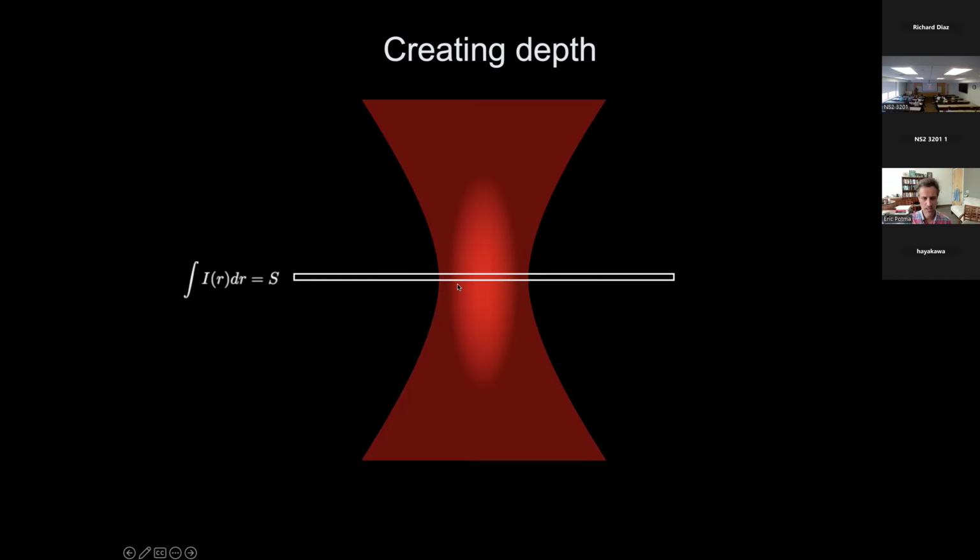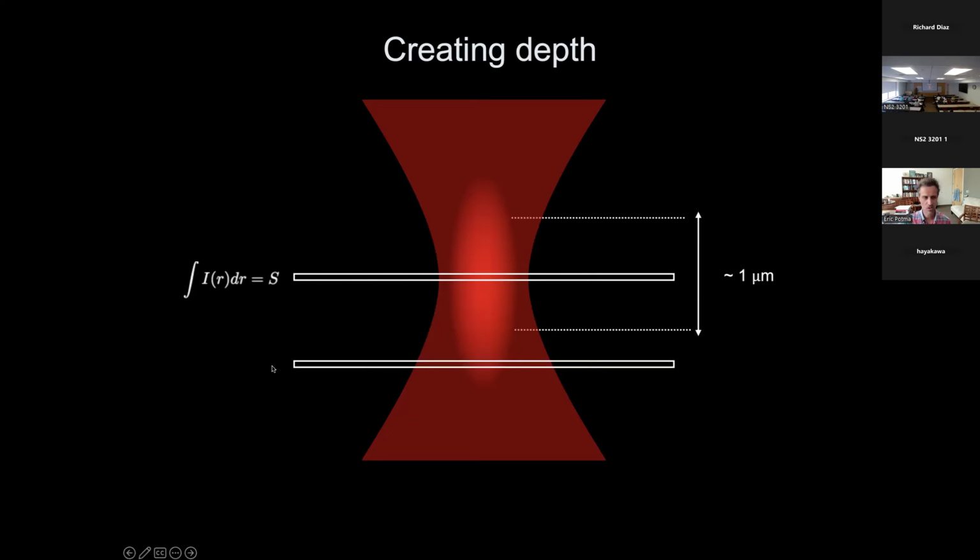But the question that I'm asking myself, what happens if I lower this detection plane? So what if I now move it beyond the length of the cigar? Okay, so let's say here. So this plane right here, what is the intensity of the light in this plane? Okay, who knows what the answer is? Anybody?